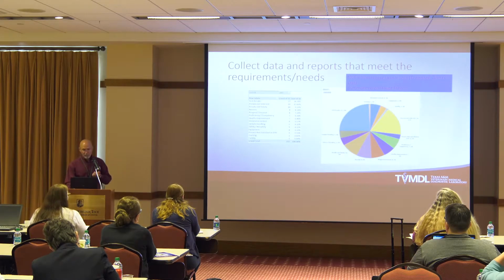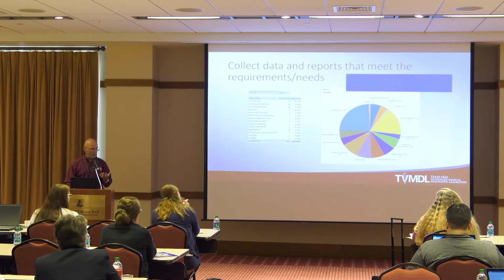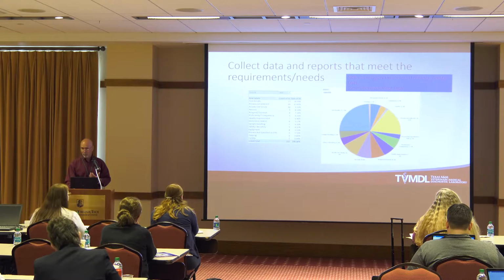These are the nonconformances, and this is from all sources. So we have nonconformances that are related to feedback. We have nonconformances that come from audits, internal audits and external audits. And we summarize all those, and this is the one we'll walk through in detail here in a moment. We present this type of graph to the management review meetings so they can focus in on where we need to aim our resources to try to make improvement, that continual improvement to our laboratory.